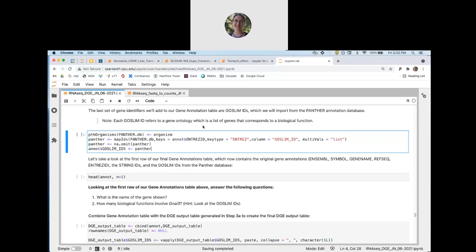In fact, I've seen databases, there's a database called miRNet, which has microRNAs and long non-coding RNAs, and it has inferred relationships, and it'll give you a percent confidence for the relationship. And this is all based on literature mining.